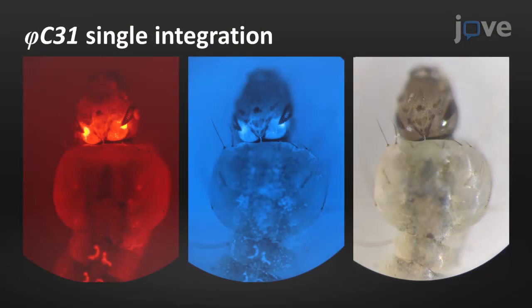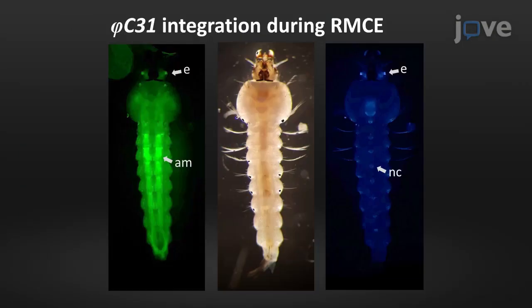This protocol supports the characterization of the role of mosquito genes involved in a variety of physiological pathways, including, for example, insecticide resistance and malaria parasite development. The method drives transgene insertion into single pre-characterized genomic locations, and therefore allows direct comparison of phenotypes resulting from alternate transgenes, effectively avoiding the issue of positional effect.